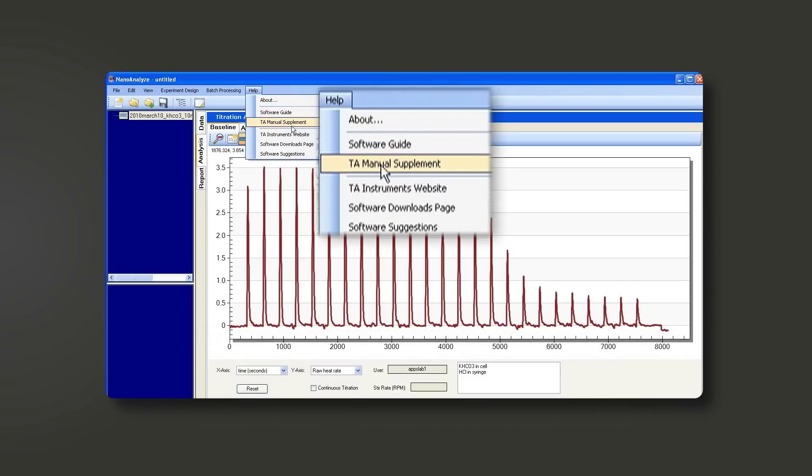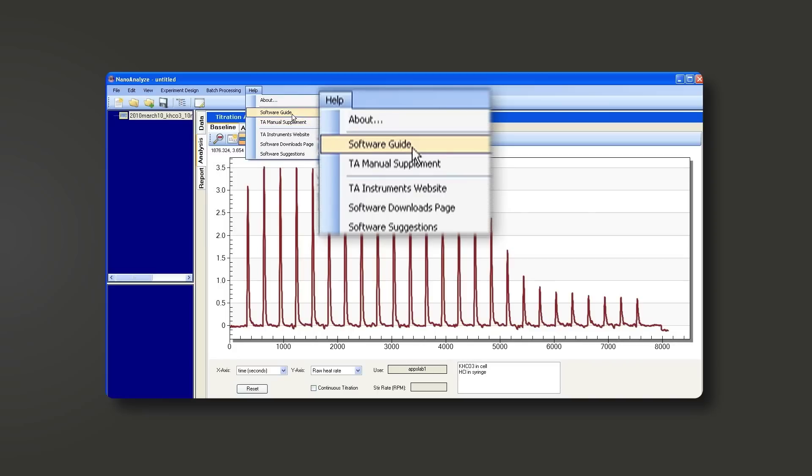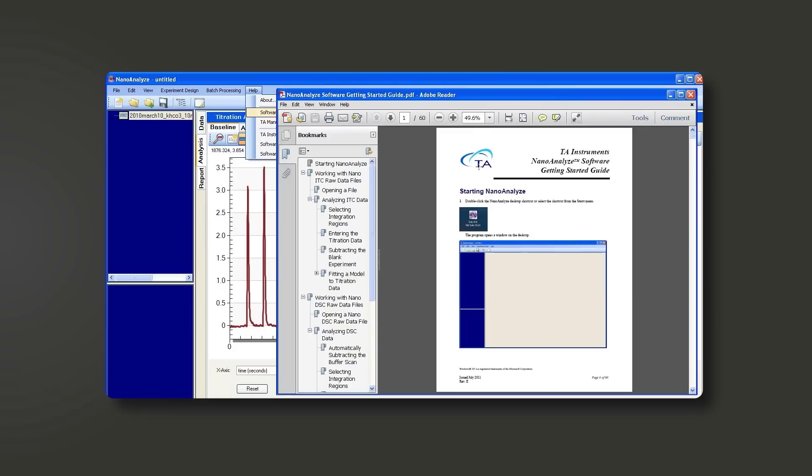Once it's open, you have a software guide and a TA manual supplement. TA manual supplement is for instrumental installation. Software guide is there to access the instructions for Nano Analyze.